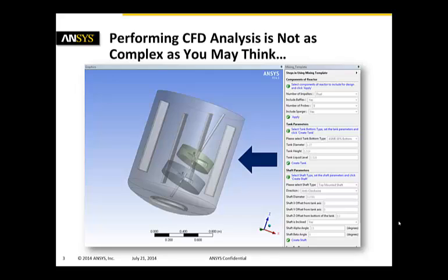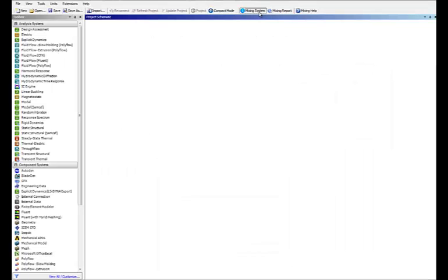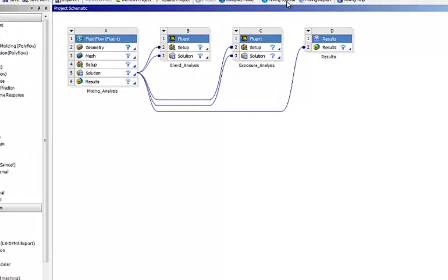In the next seven minutes I will demonstrate to you that performing such a CFD analysis is not as complex as you may think. Now we start in ANSYS Workbench and we activate the mixing template which is extremely easy to install.